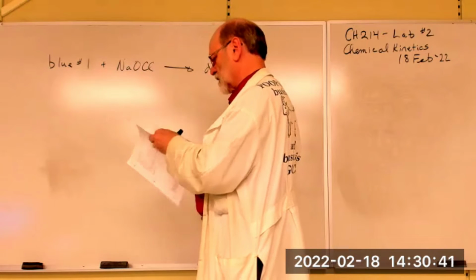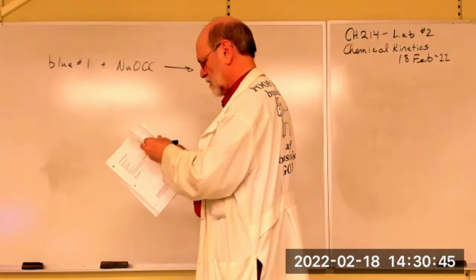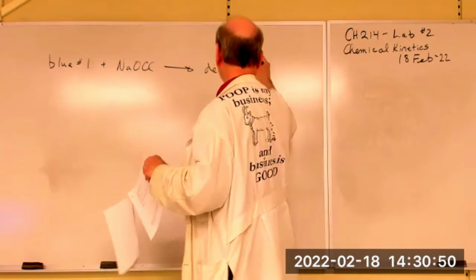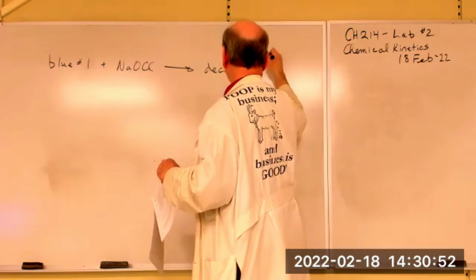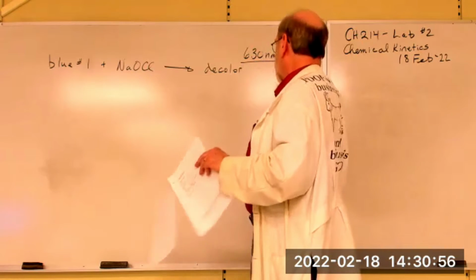Well, something's up here. Did I put it in your copy? I think it's 630 nanometers. We're going to watch the absorbance.